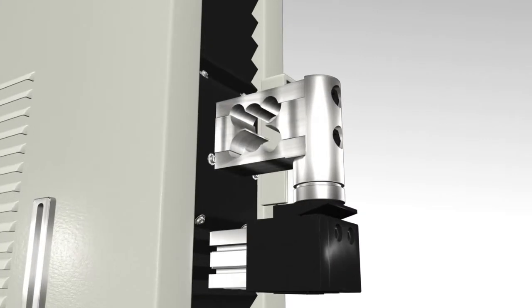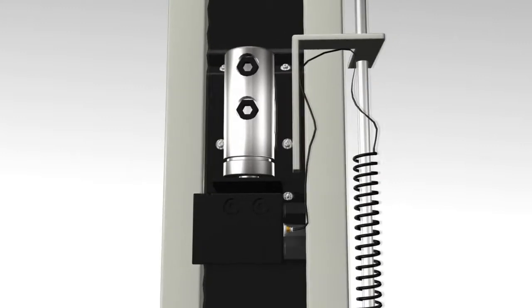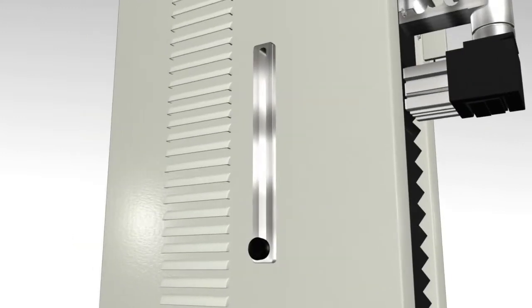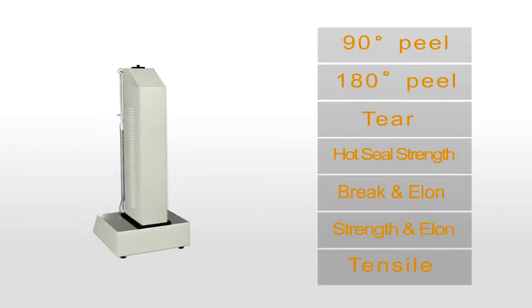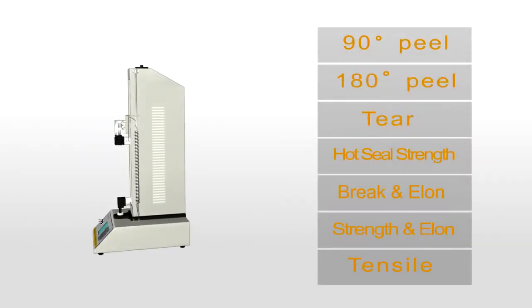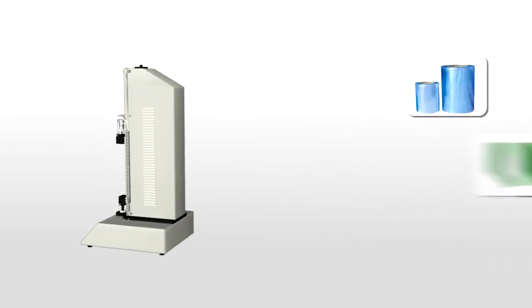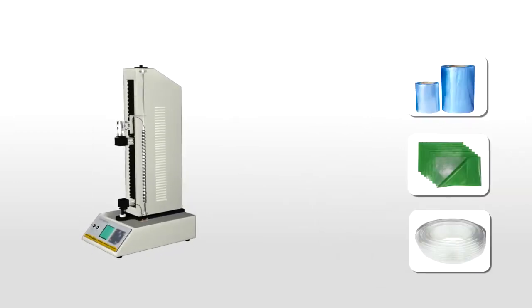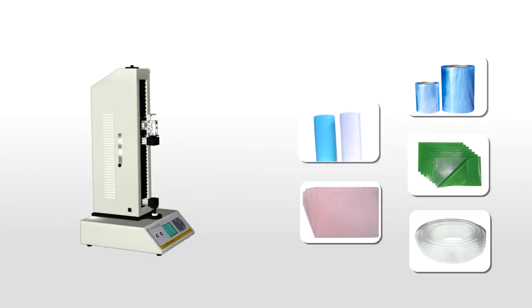XLWM has a high precision load cell and the functions of power failure memory, overload protection, over travel protection, and automatic position reset. It is designed to measure the tensile strength, peel strength, heat seal strength, and tear resistance of plastic films, composite materials, flexible plastic tubes, release paper, non-woven fabrics, and other materials.